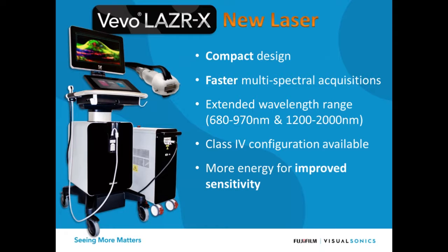I want to talk now about our new laser, and I didn't have a separate picture of it here. You can see it here, and you can already see that it's quite a bit more compact and more sleek. Really has a nice look to it, which matches the 3100. It's also faster, faster acquisition times.